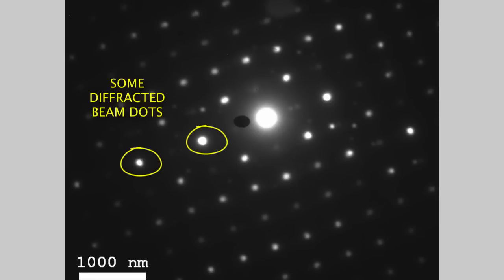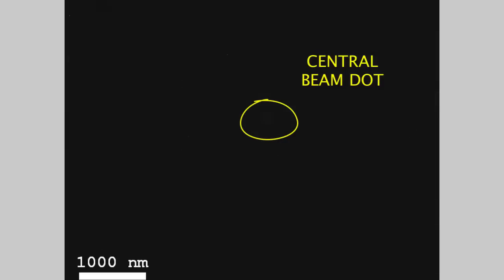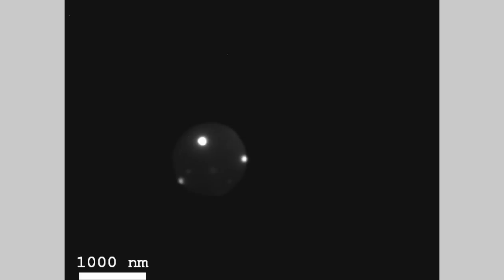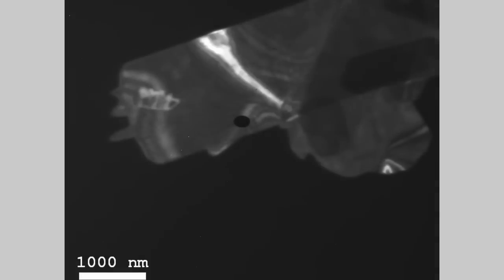I want to create a dark field image. What we do then is we put in the objective aperture and choose the spot in this diffraction image that we want to create the dark field image from. Here I put in the aperture. You can see it sort of selects out a few diffracted dots and the central beam as well. We choose a smaller one. Now I choose a smaller aperture. And then I move it so it only contains a few of the neighboring dots. Let's say these two. And then we go back to the default imaging mode. And the dark field image shall appear. So this is the dark field image. Here the white represents those electrons that were diffracted into that little aperture slot that we selected. Here is the standard bright field image again.